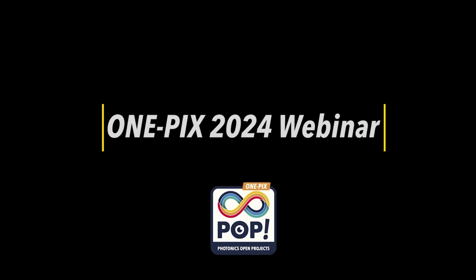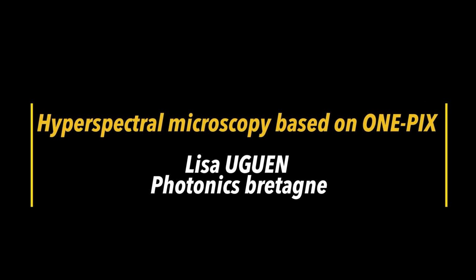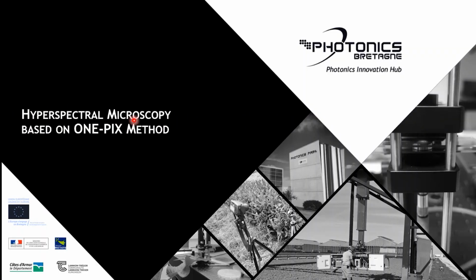Good morning, everyone. I work for Photonics Bretagne, and today I will present you a subject of hyperspectral microscopy based on the ONE-PIX method.